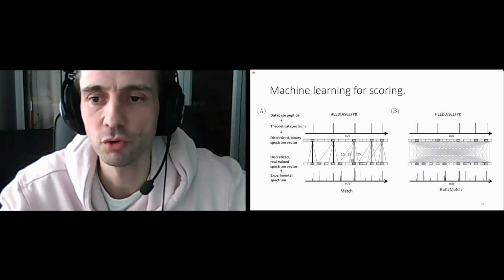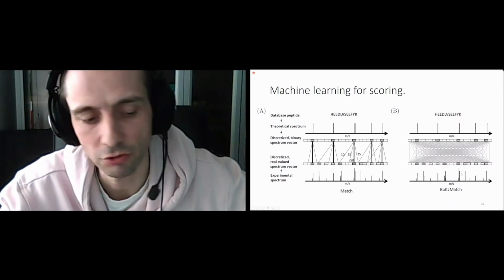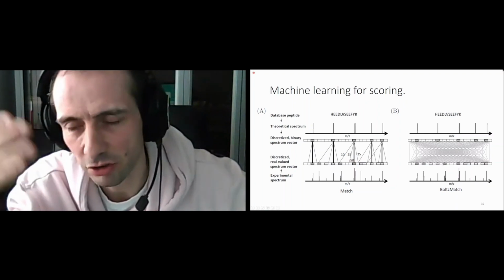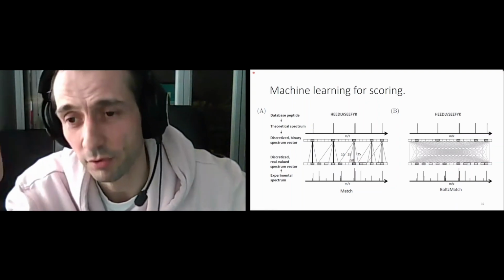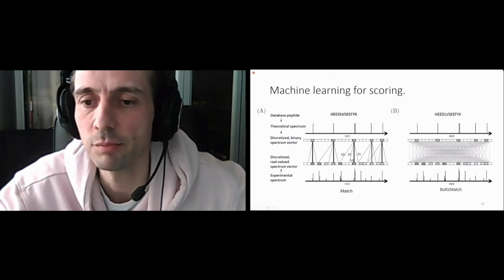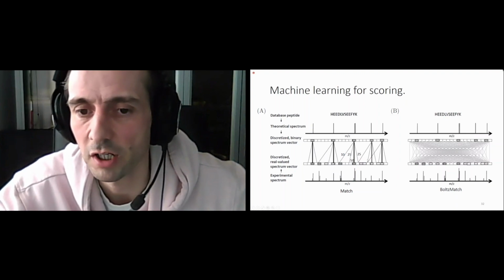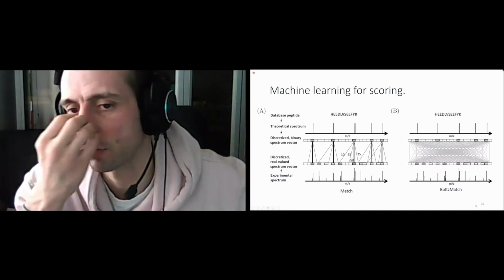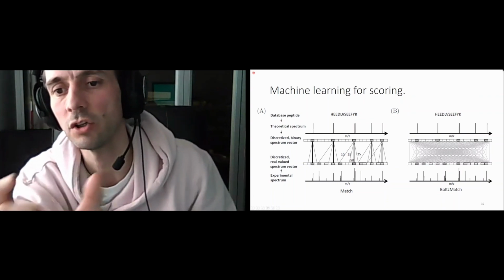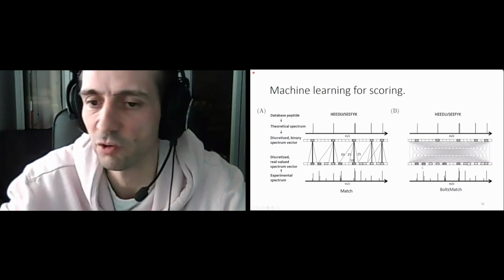One way to improve this model, and actually we did it, because indeed it's very difficult to train and takes lots of time. And if you keep training, you need to stop the training after a few epochs, because then it overfits. To improve the computation, we don't need to use a fully connected layer, but we can use a one-dimensional convolutional layer, because it's just a sliding window going over the experimental spectrum.